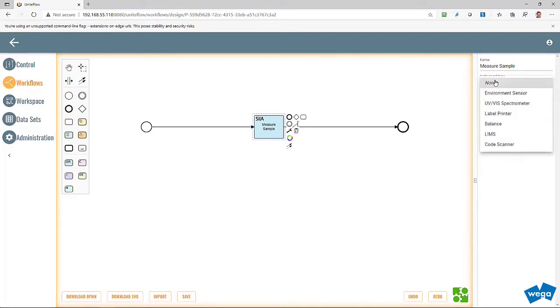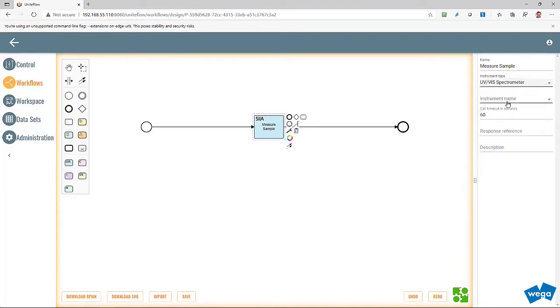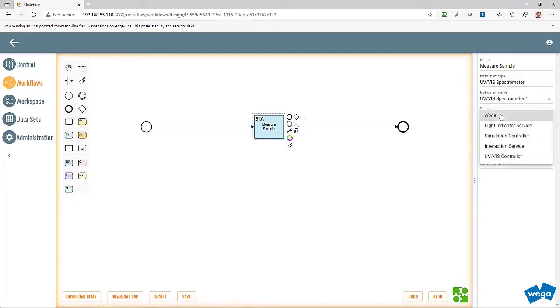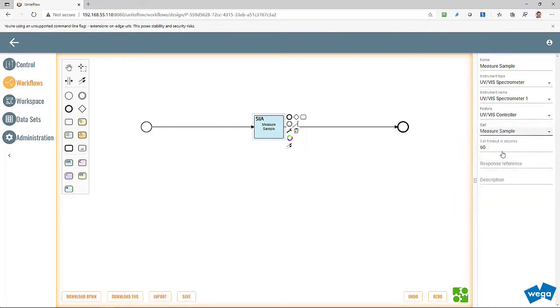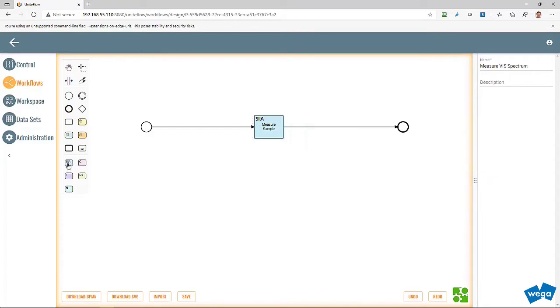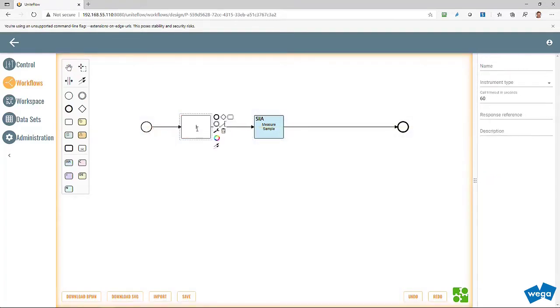Every BPMN workflow has a start and an endpoint. SELA tasks can easily be dragged and dropped into the workflow and configured afterwards. We use the command measure sample from the UV-Vis controller feature to configure the SELA task.